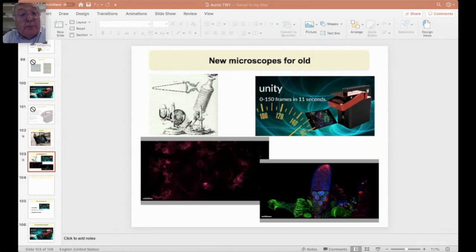You know, to build a proper beam scanner. Oh, wait one moment. The other people who built beam scanners very early on was the Japanese company Lasertec. And they had a hybrid scheme. They had a mirror for scanning in the relatively slow frame direction, and they had an AOD for scanning in the line direction, and that was a real-time microscope. So I'm going to guess that might have been the first commercial high-speed beam scanner. But I don't really know the answer.